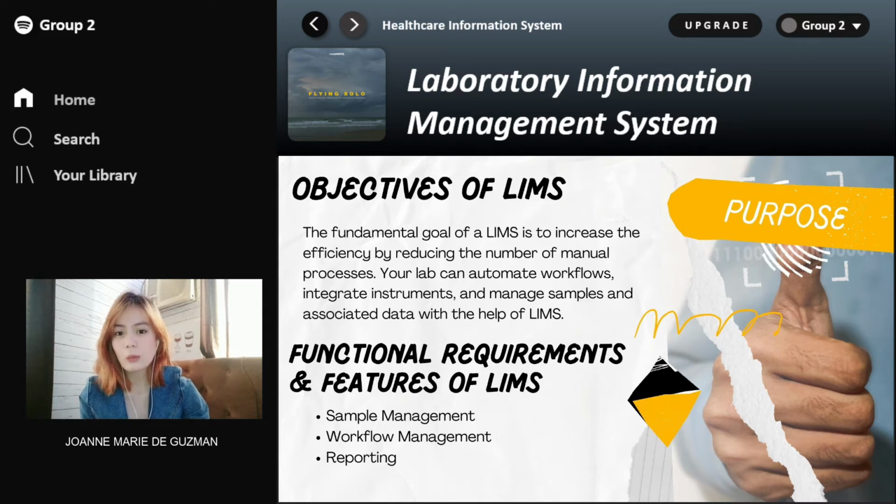First is sample management. To ensure that the samples are not lost or mixed up, accurate and complete records are required. If the sample satisfies the allowed levels, a record should be kept. Workflow management can be utilized to save time by automating records and workflows.